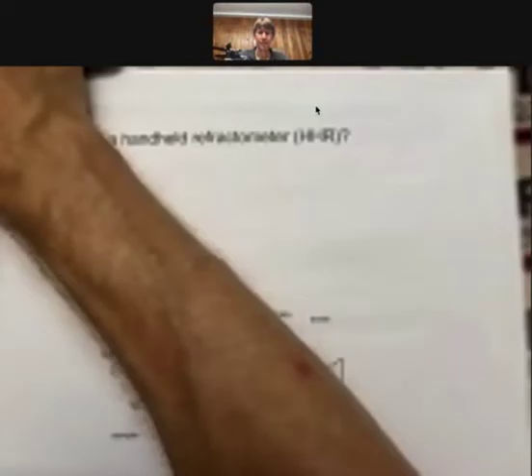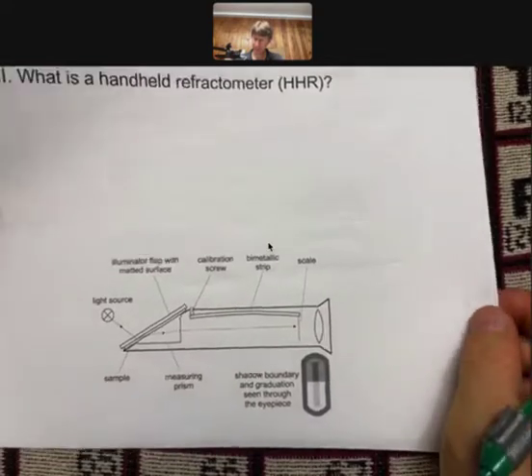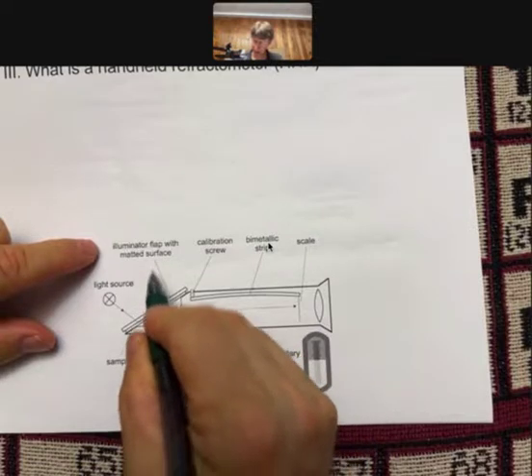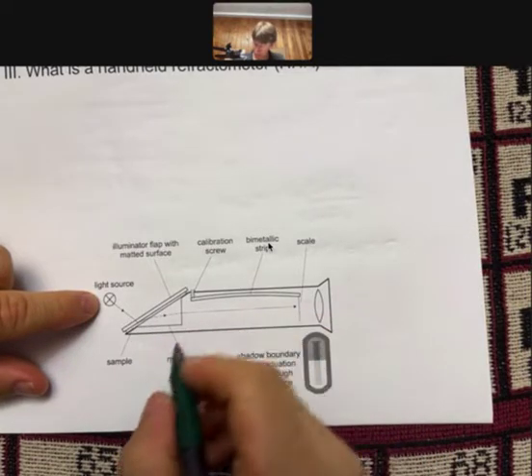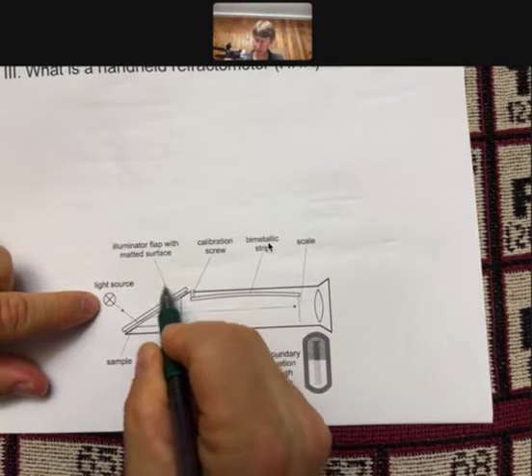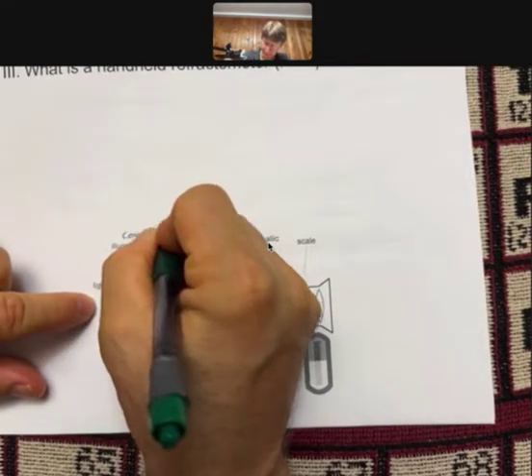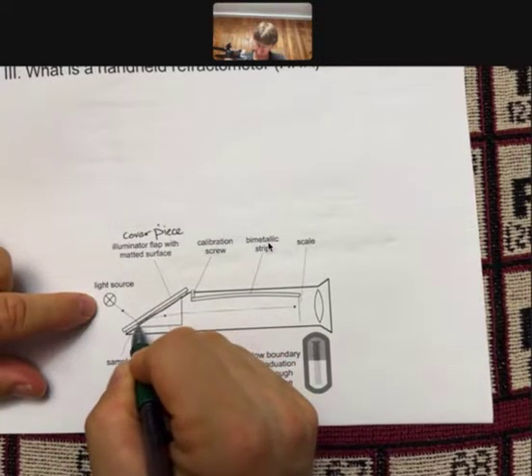Let's look at this picture of our handheld refractometer and talk about it with respect to Snell's law. It has an illuminator flap — that's the part that comes up. There's a light source, a measuring prism right here, and your sample. You put two or three drops right here at the top, and when you close this — I call it a cover piece — the solution you're studying will go all the way over this prism.